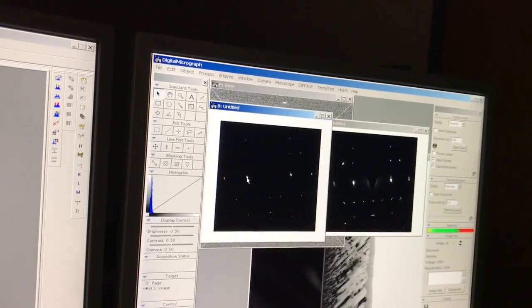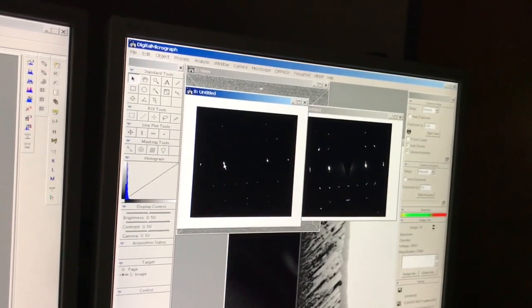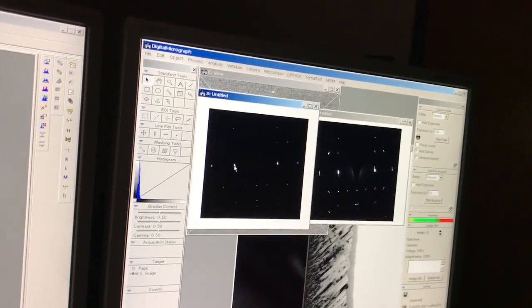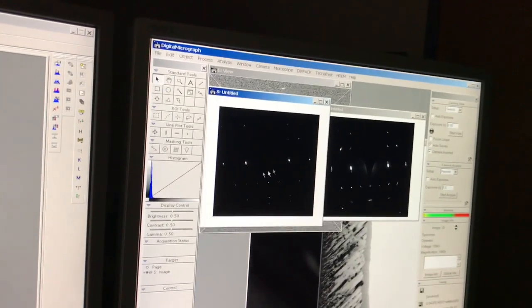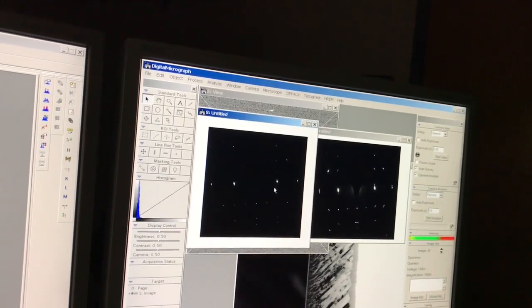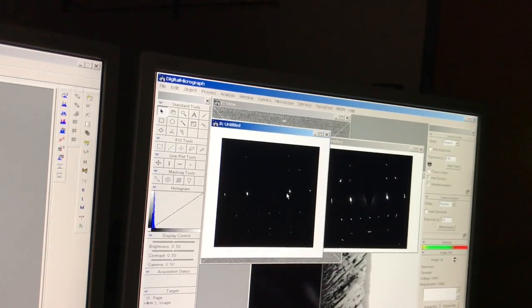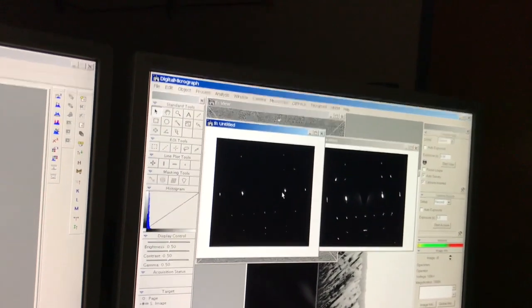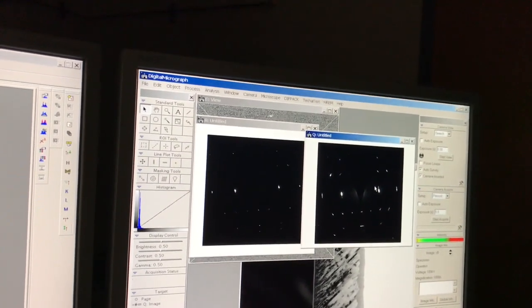Okay, again, it's not a perfect single crystal. But if I isolate less and less of an area, I get closer to that. If I go down to literally nothing, then in principle I would have focused spots. So I see less evidence of the imperfections in a smaller area, or using a smaller SA aperture, than I do here. Okay, so I hope that makes sense.